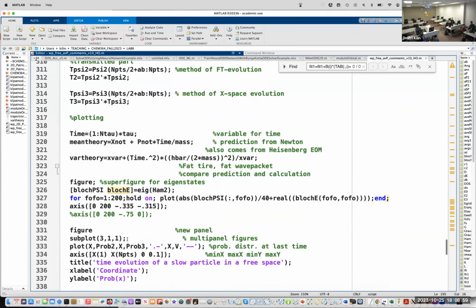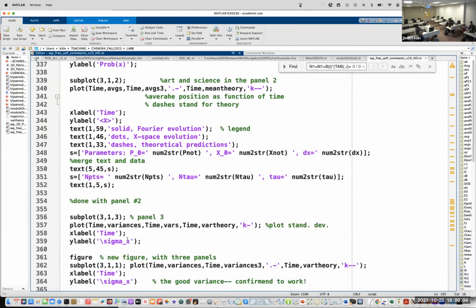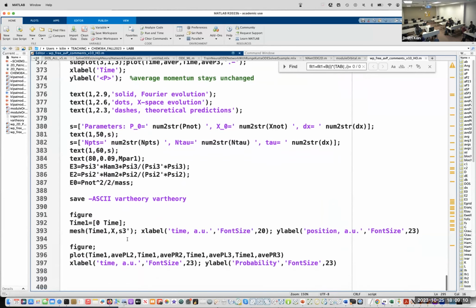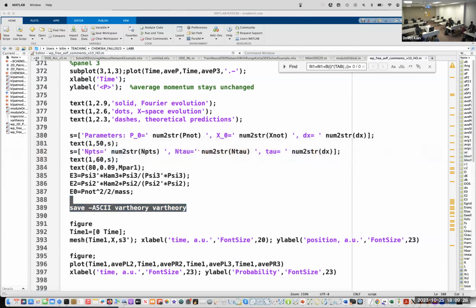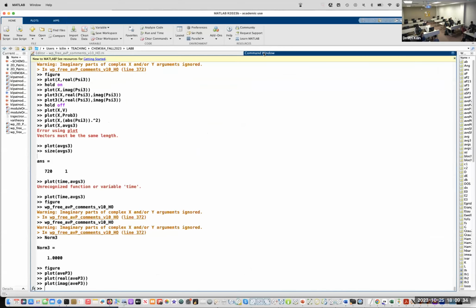What to save? Let's check. Does it do any saving? Oh, yes. So at least some variable it does save, but we can manually add if you need to replot any of the variables manually by a different plotting tool.